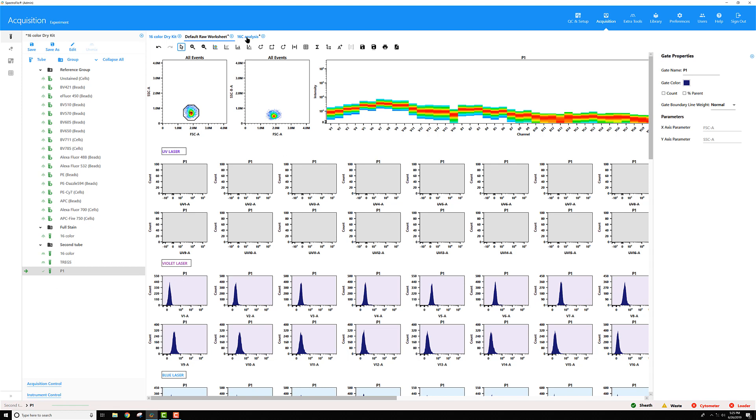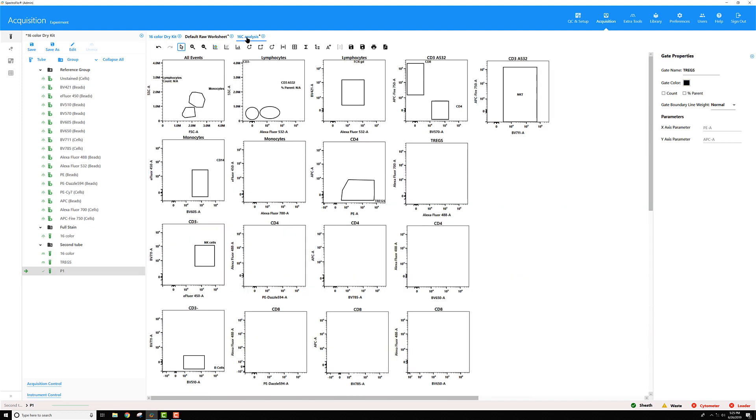If I go to an unmixed worksheet, while pointed to that tube, I'm not going to see any events.